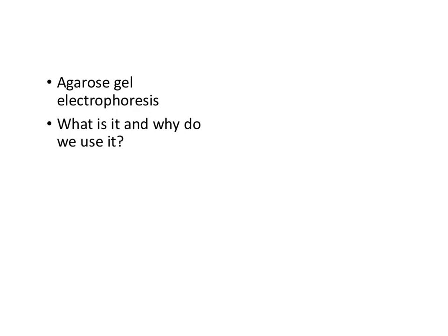So agarose gel electrophoresis, hopefully you've seen the video. Does anybody have any questions about gel electrophoresis? We're going to go through a couple of examples of how it works and analyzing PCR products digitally on slides. Any concerns? Okay. So what is it and why do we use it?